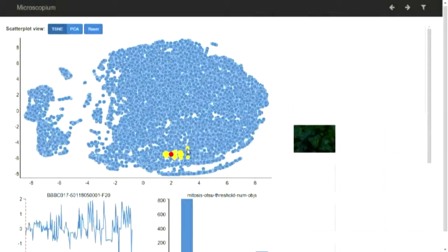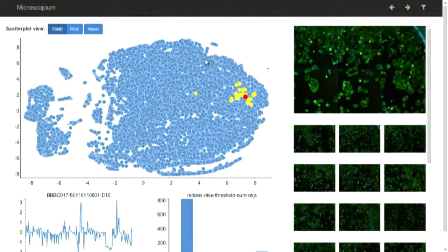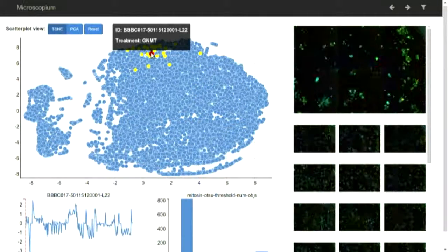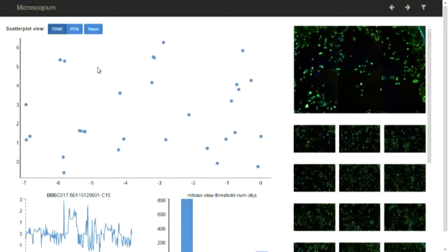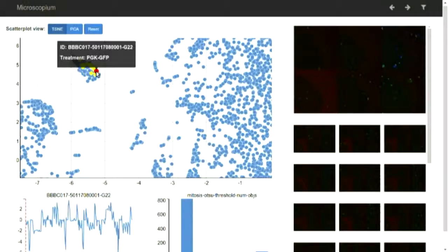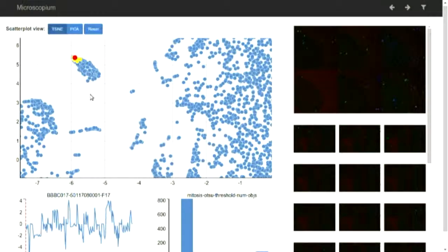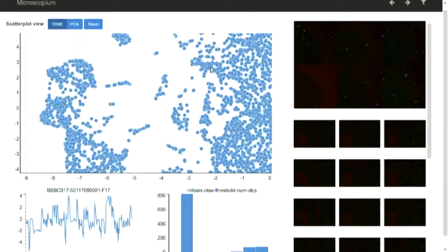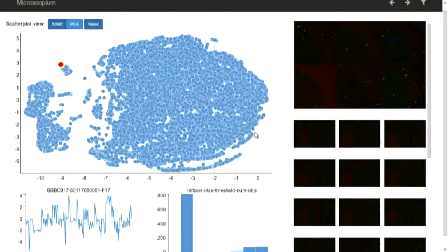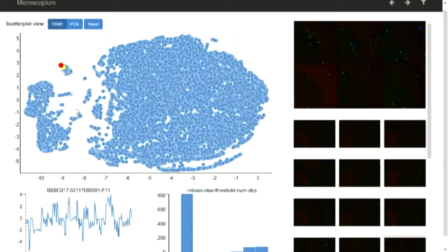When I click around the graph, a few of the images are missing because I haven't loaded them all on my laptop. By clicking around the graph, I've actually captured most of the variation in the data set and I can zoom in to different parts of the scatterplot. In here, it's created this clustering of images where the cell's not being expressed much at all. I can also go to other parts of the graph by clicking on the images.